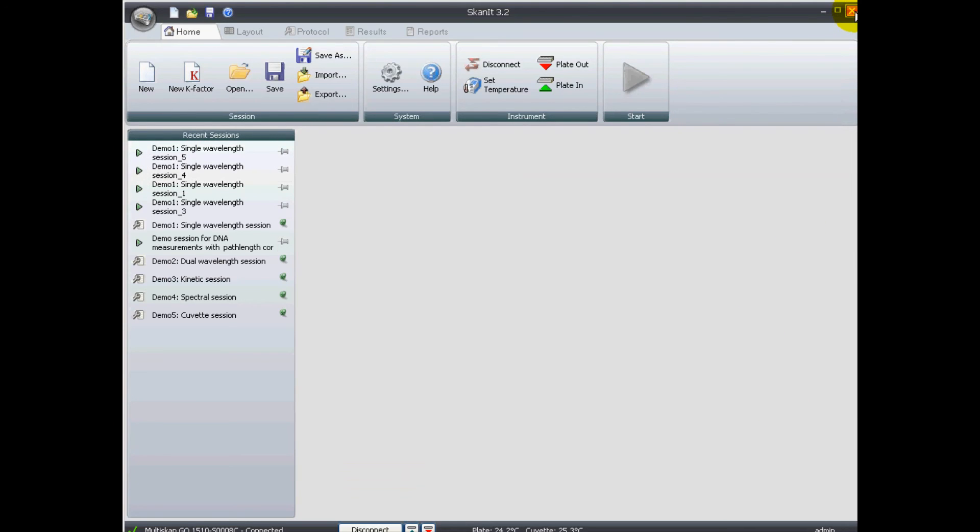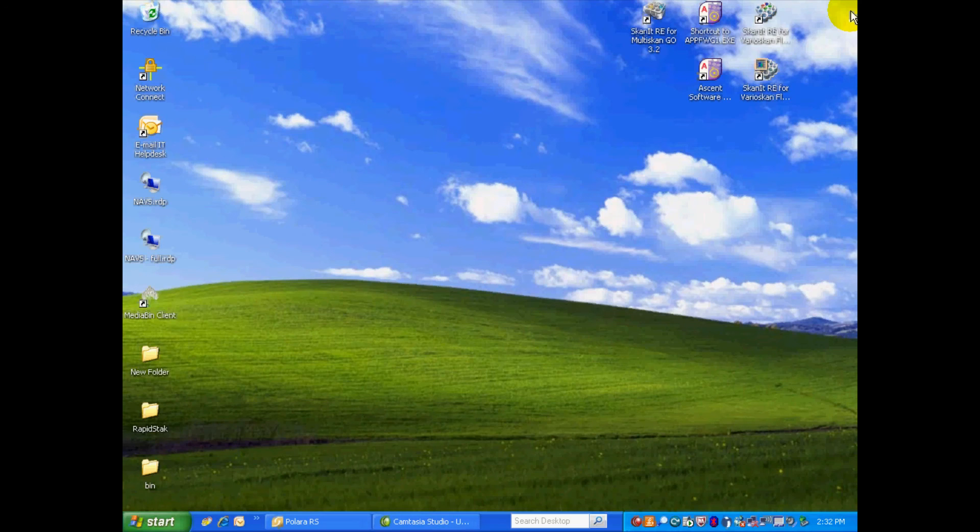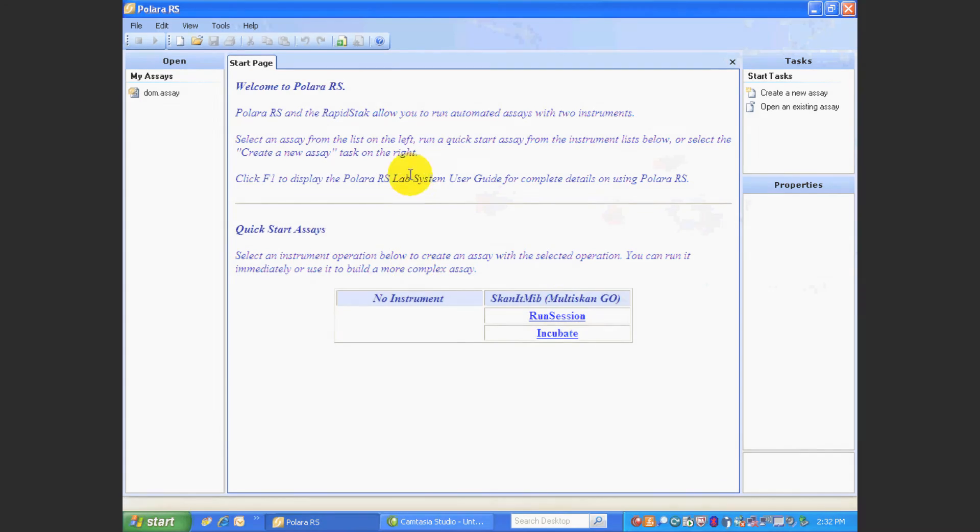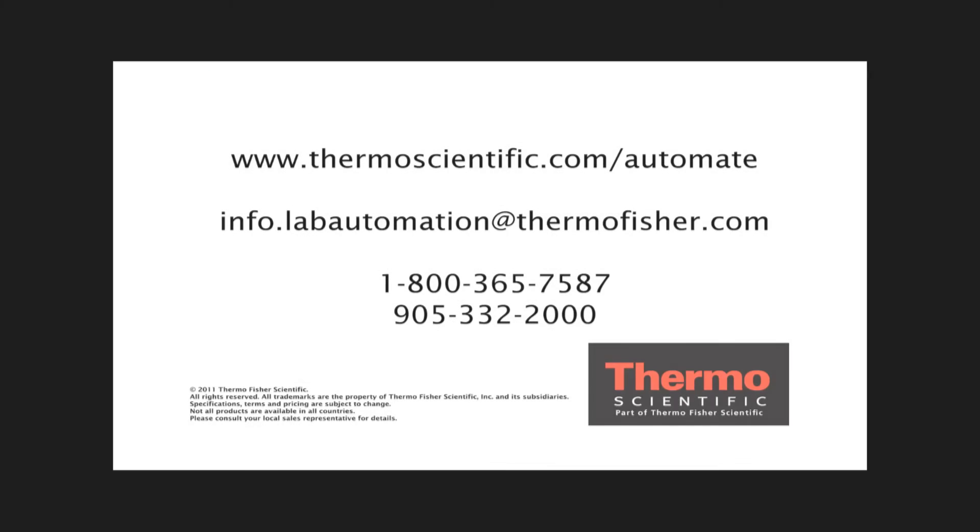Let's close this. And close that. We'll go back to Polara RS.